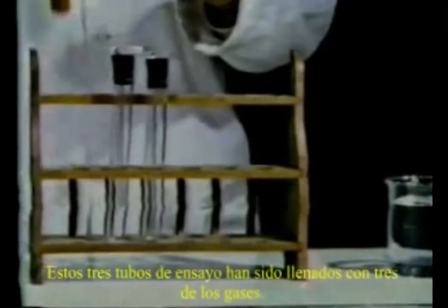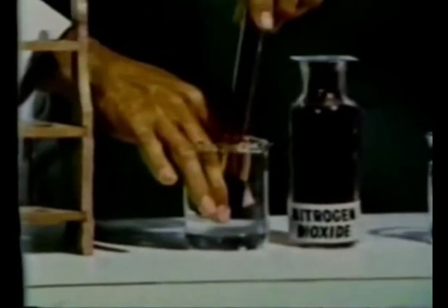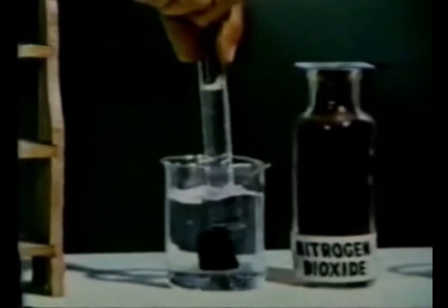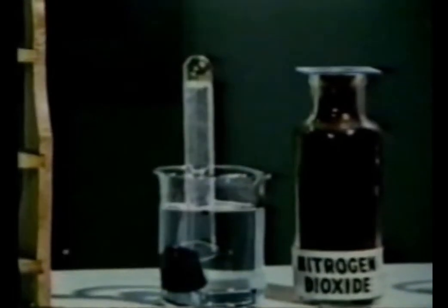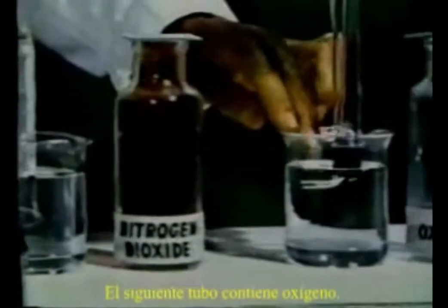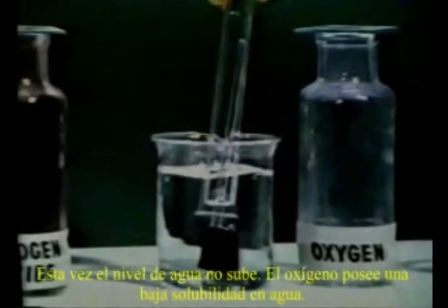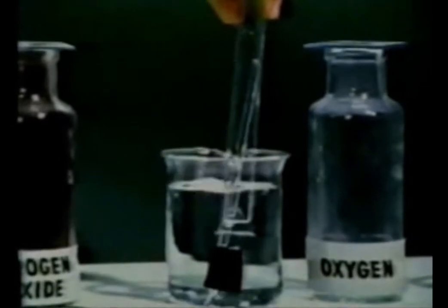These three test tubes have been filled with three of the gases. The first contains nitrogen dioxide. When the test tube is opened underwater, the water level rises, showing that the gas dissolves. The next test tube contains oxygen. This time, the level does not rise. Oxygen has low solubility in water.